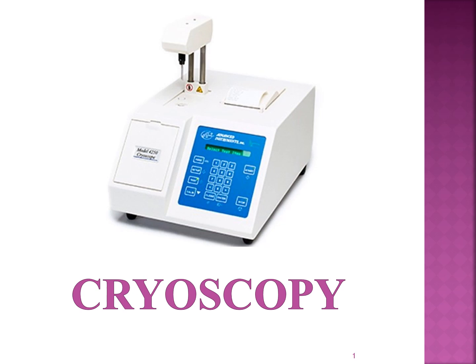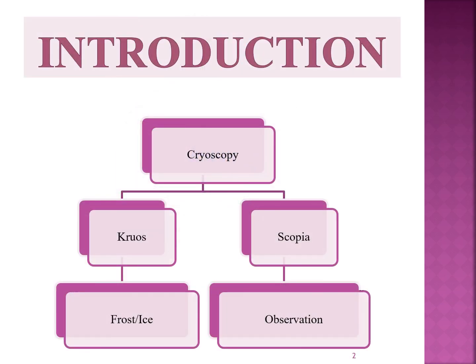Today we are going to learn about the cryoscopy technique. Cryoscopy is actually derived from two words. Cryos means frost or ice and scopia means observation.